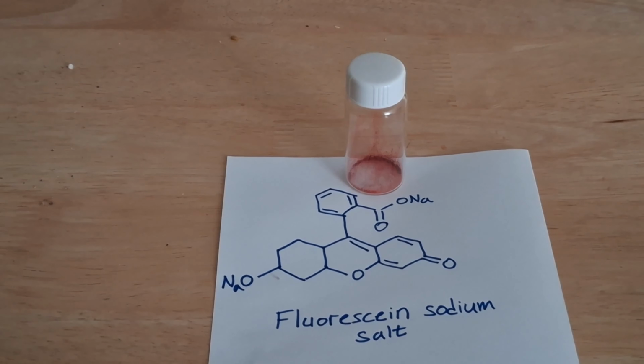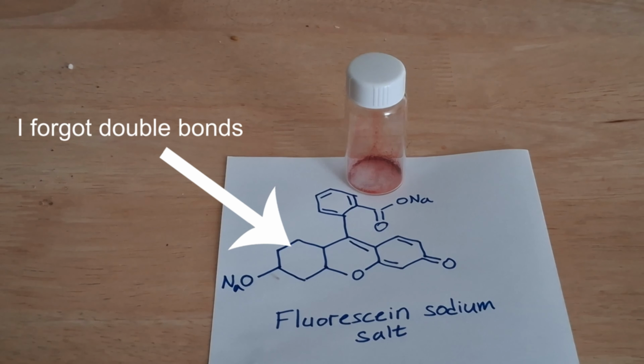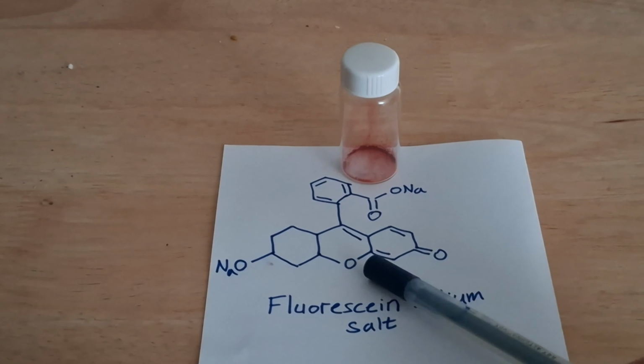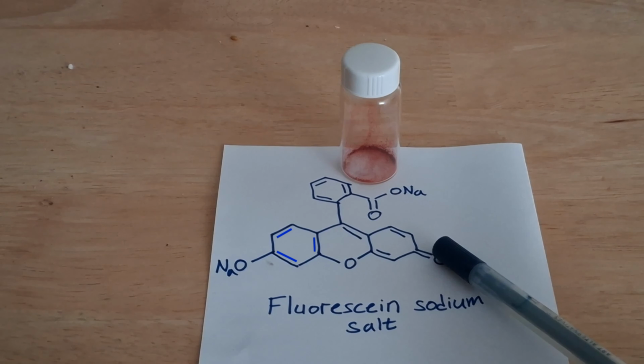Here we have a beautiful reddish solid. This is a fluorescein sodium salt. It looks like an ordinary powder, but it has a special property. It glows in bright color under light. And this is the structure of the molecule.